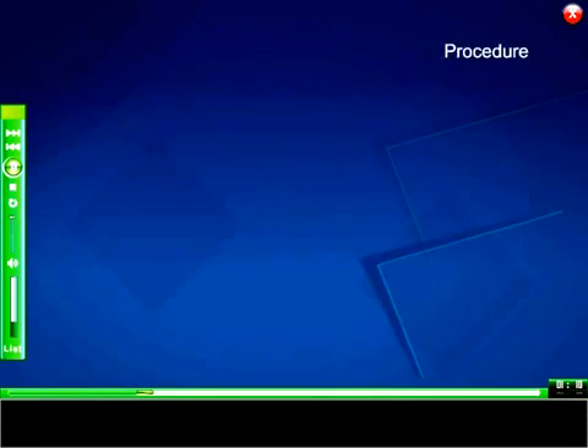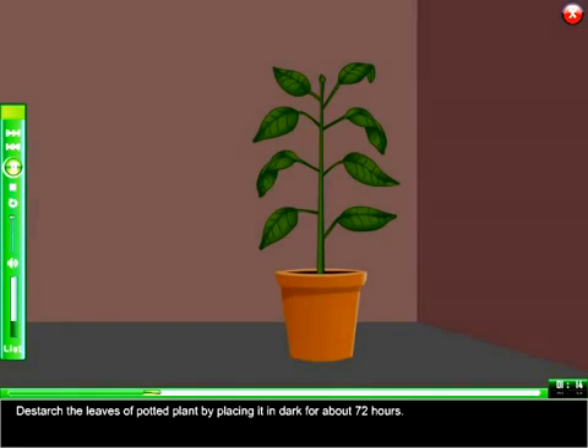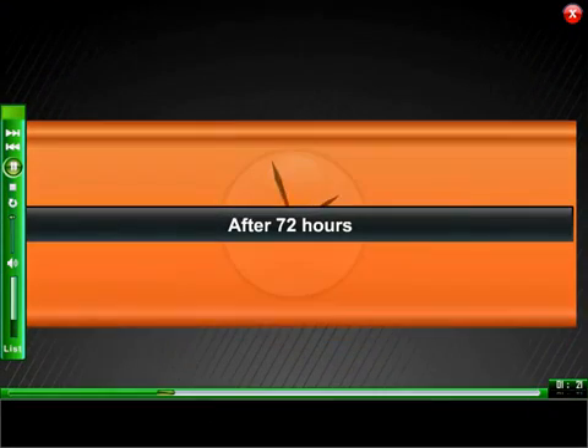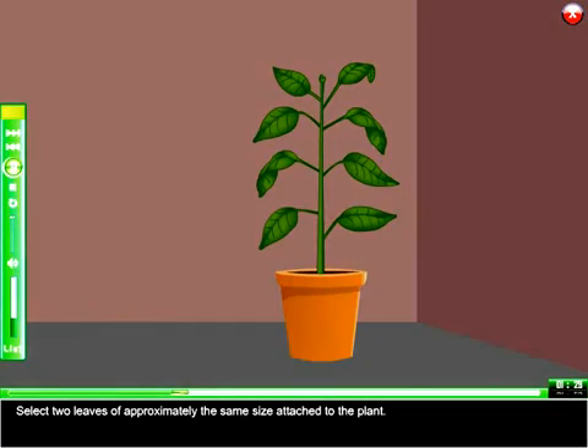Procedure: Destarch the leaves of the potted plant by placing it in the dark for about 72 hours. Then select two leaves of approximately the same size attached to the plant.